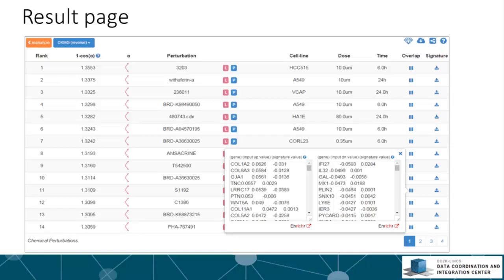For gene set search, the search score is the overlap between the input differentially expressed genes and the signature differentially expressed genes divided by the effective input.